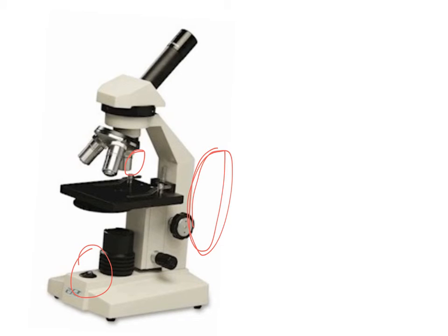When you are done with the microscope, please return it to its original condition. The stage should be all the way down at the bottom, the low power objective should be clipped into position, the power cord should be wrapped around the prongs again, and the dust cover should be placed back on top of the microscope.